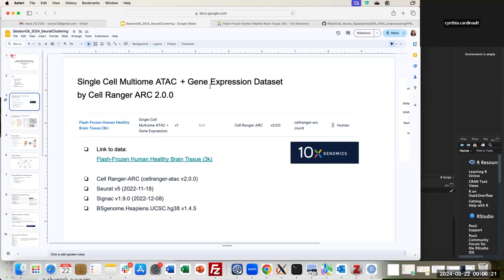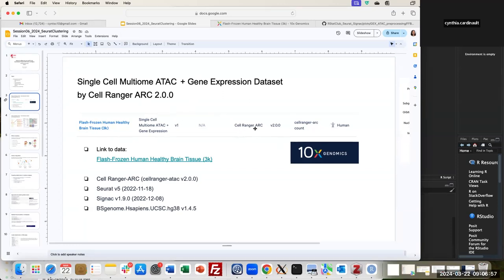As a reminder from the first session, the data we are going to use is a multiome dataset that has ATAC and gene expression. This data comes from flash-frozen human healthy brain tissue and contains around 3,000 cells. The count matrices were generated using the Cell Ranger ARC pipeline version 2.0.0.